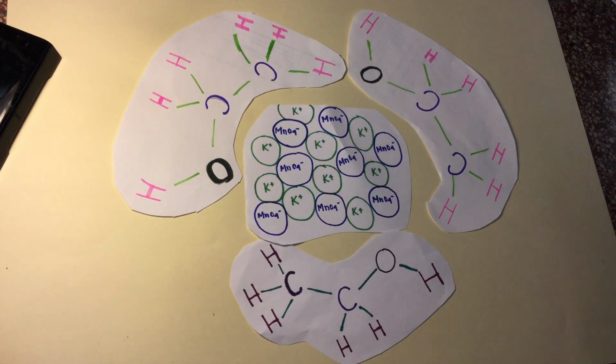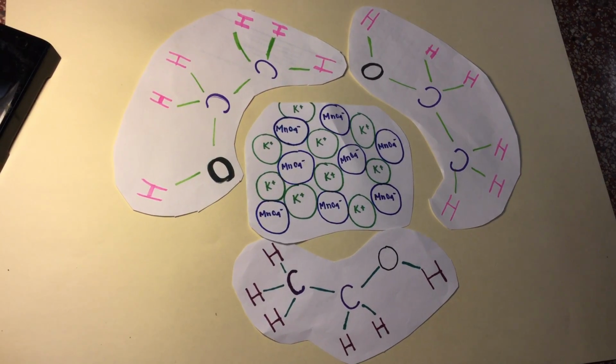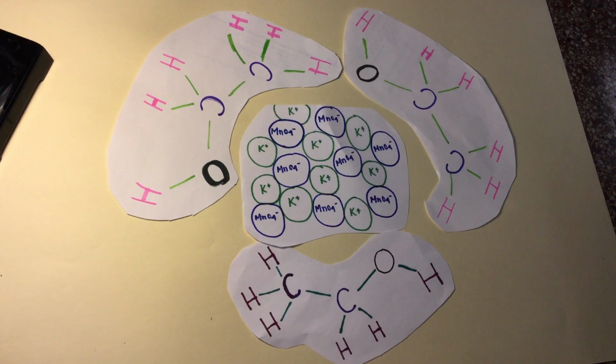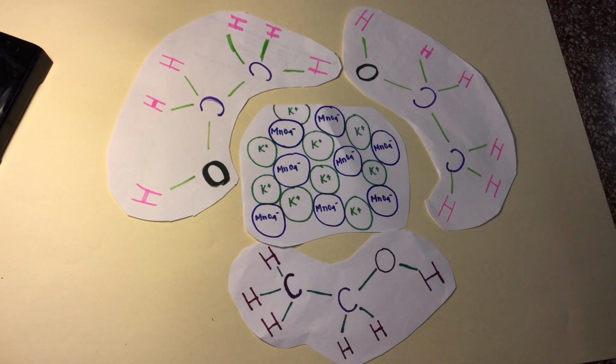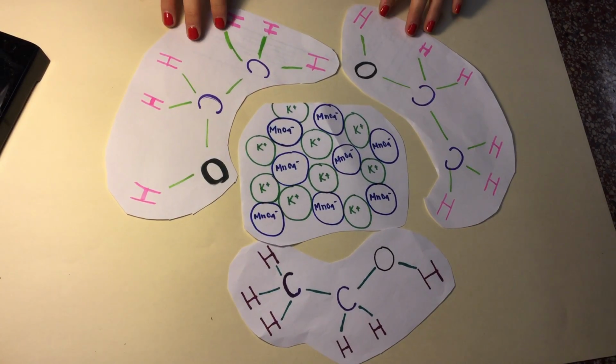The potassium permanganate is held together by ionic bonds, while ethanol is held together by hydrogen bonds. And since the energy released is not strong enough to break apart these bonds, the potassium permanganate is not able to bond with the ethanol. Therefore, ethanol is not strong enough to dissolve potassium permanganate.